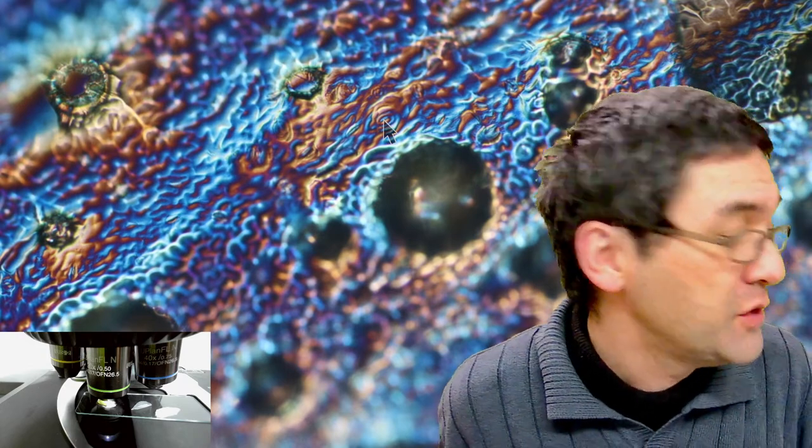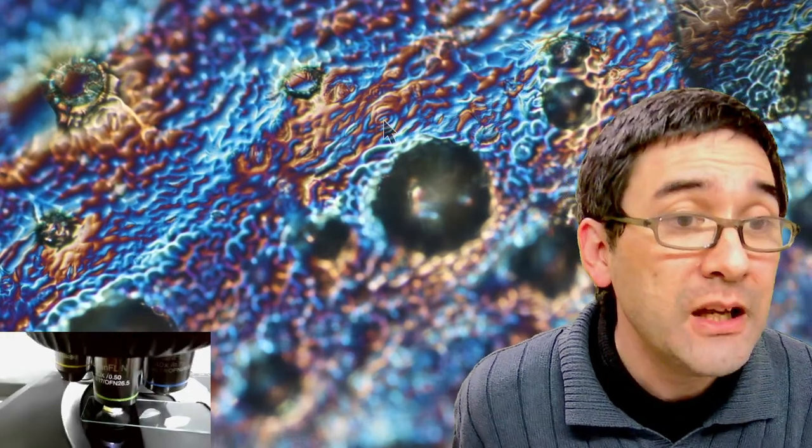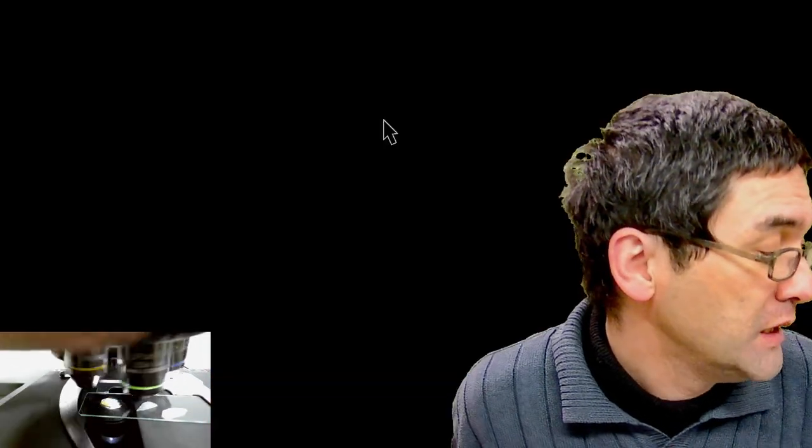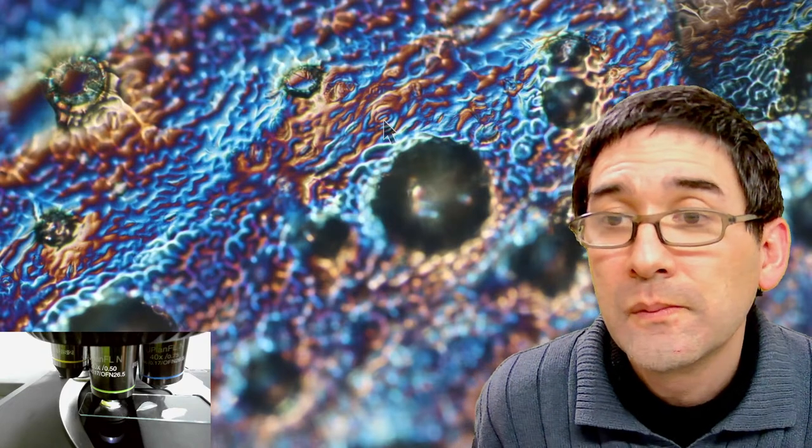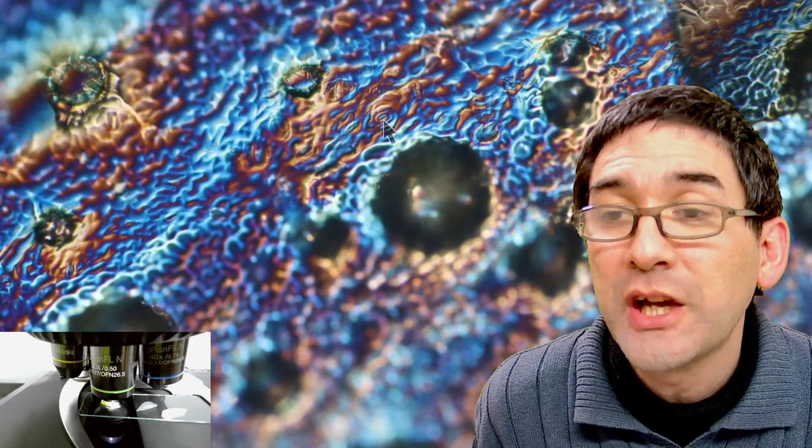Which objective is right now? You can always see it over here. This is now a 20x objective — you're not able to see the magnification. It's a 20x magnification, and this here is the 10x magnification.